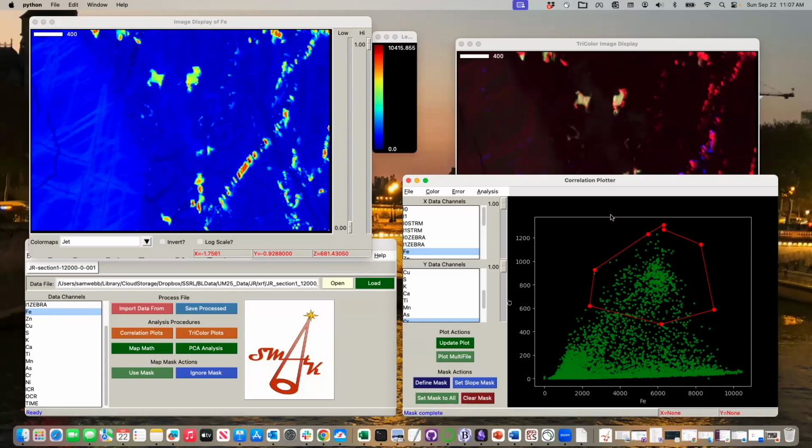It's gotten better than it has been in the past. Often if we had really large data files, you could never close that loop. If you go to, I want to say, analysis and say close mask, that's the same thing as double clicking. So if you did have a problem with not being able to close with a double click, go to analysis and close mask, and that will close it. Also, if you're on a larger keyboard, like my desktop in my office, which actually has a real keyboard rather than my laptop one, at least on Windows, I have no idea for a Mac, if you hit the end key, it will also close the mask.